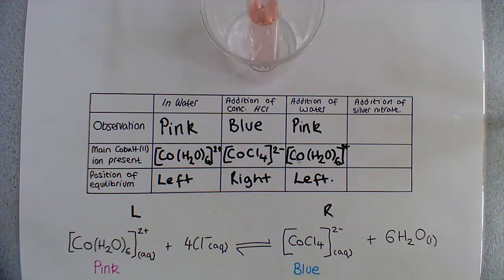So the last thing we're going to do is add some silver nitrate. Those of you that do triple or are studying A-level should know that silver nitrate can be used to test for halide ions.